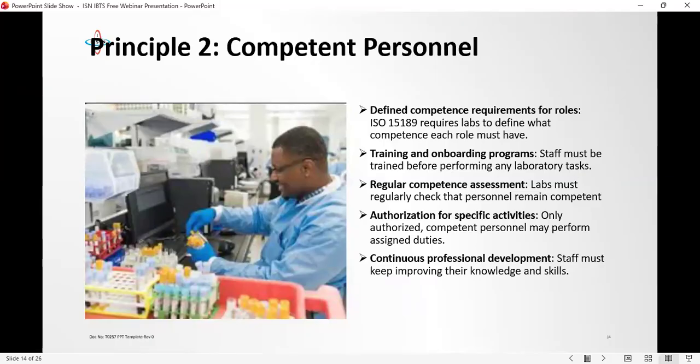So there should be some kind of onboarding for all cadres of staff that come into the laboratory. Be it a cleaner who you think is inconsequential, and you will send that person to buy food. By the time they do not wash their hands, they will use gloves, touch the door, touch your bottle, and bring it for you. They are running very good errands. Because the person does not know the consequences of their actions, you will not know when the thing will get to you. So it is imperative for every laboratory, as per requirement, to have an onboarding program for all cadres of staff, and it must be documented.